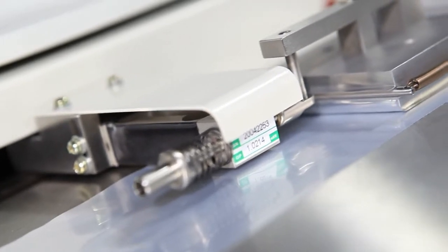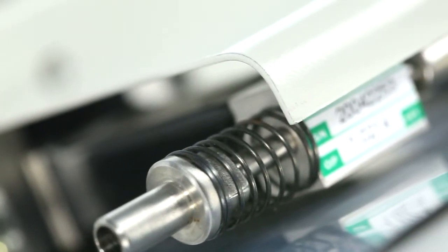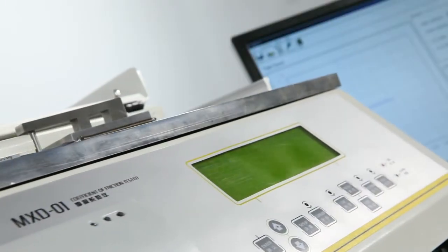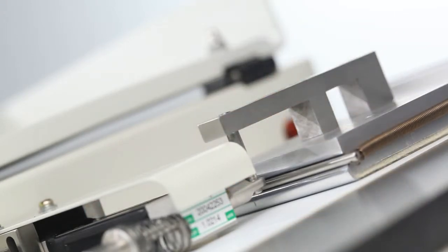Automatic COF zeroing and the 5N high-accuracy load cell add to the already excellent software and hardware support for this high-quality testing instrument.